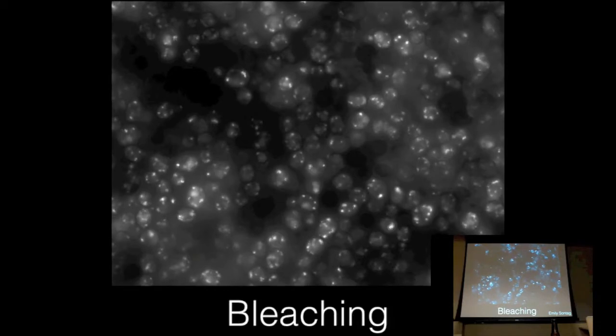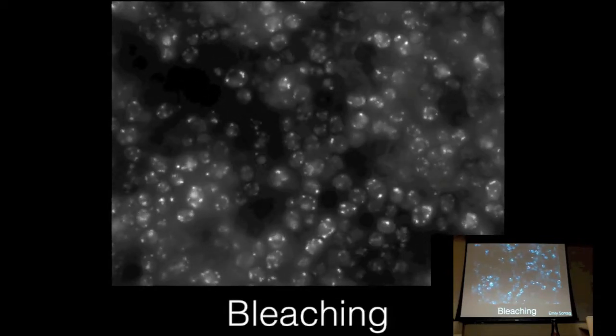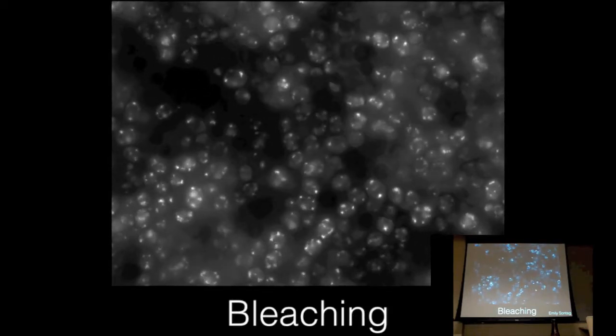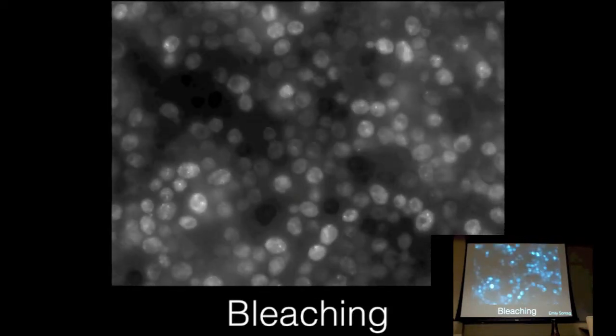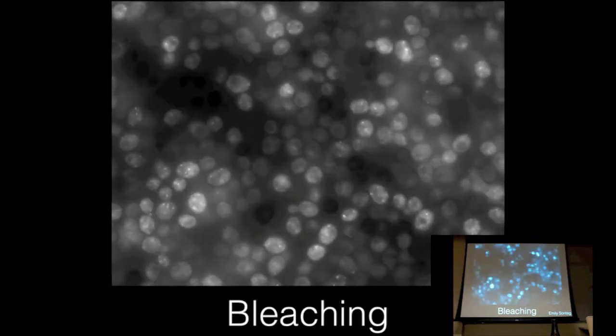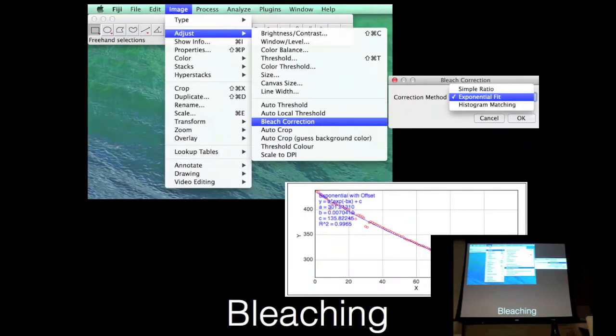So we count every puncta in the cell. They'd love to count each of these little puncta, and of course the first problem you're going to have is that the puncta are getting dimmer, so a universal threshold is obviously not going to work very well. One thing you might want to do in Fiji is run a bleaching correction, which essentially tries to find the rate at which the fluor is bleaching and then normalize for that.